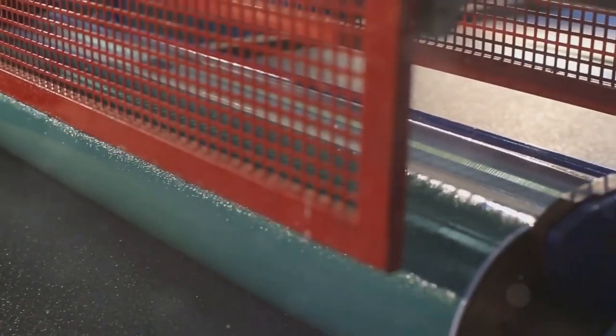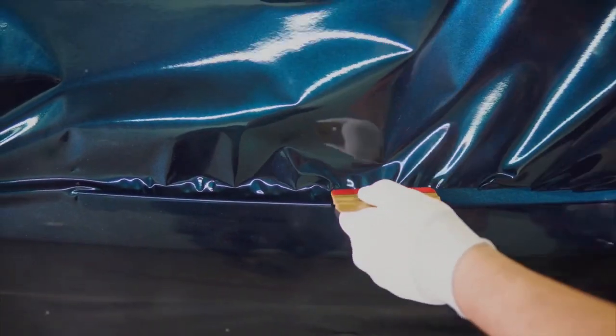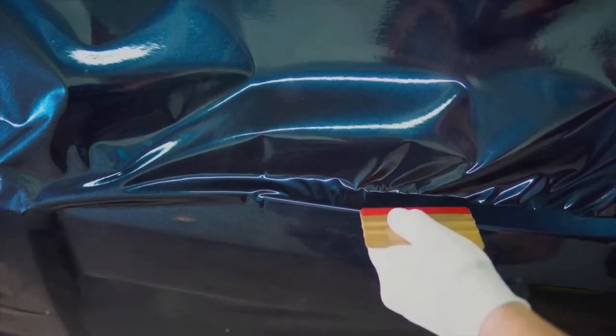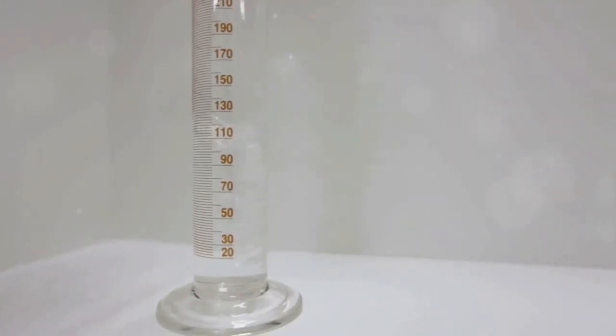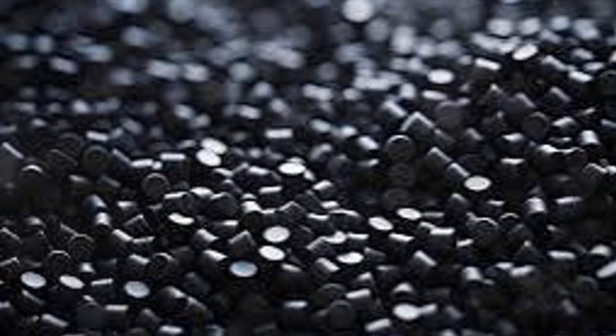Next, method B involves a 90-degree stripping test with the rubber part assembled to one metal plate. Method C takes a different approach, measuring adhesion of rubber to metal with a conical specimen. This method tests the bond under a pulling force.